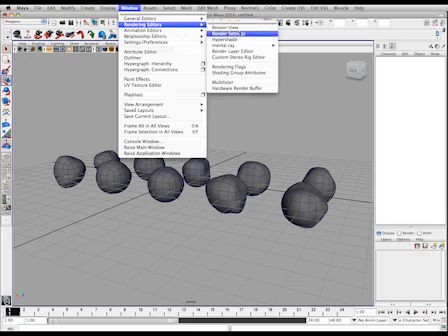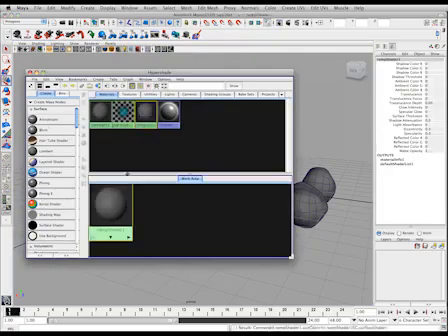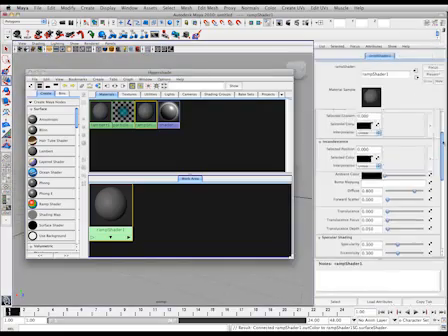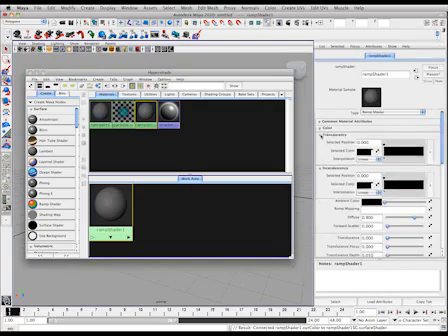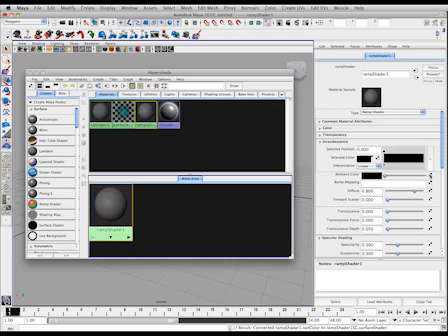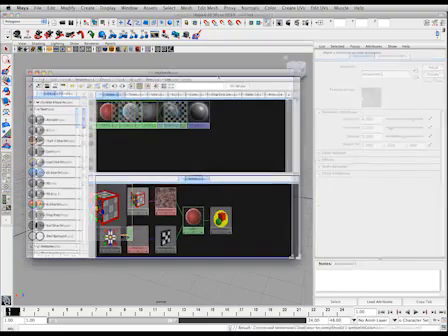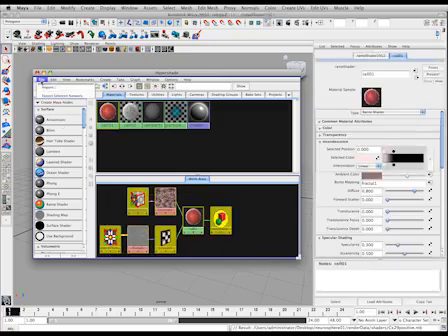Open the Hypershade window from the Windows Rendering Editors tab of the main menu. Choose a ramp shader from the Surface Materials tab. Open the Attribute Editor and set the shader's color, incandescence, ambient color, bump map, and specular color attributes. Assign a Brownian 3D texture to the ambient color node and a 2D fractal texture to the bump mapping node. Select the resultant shader's input and output connections and export the selected network.